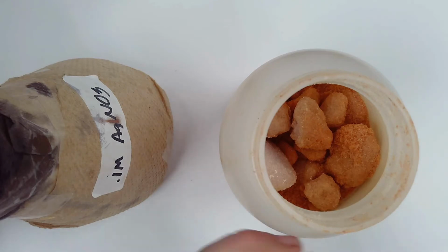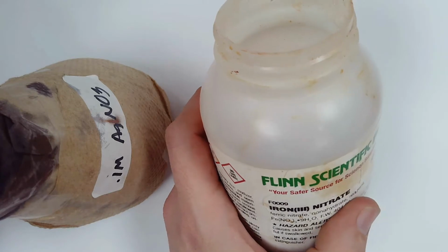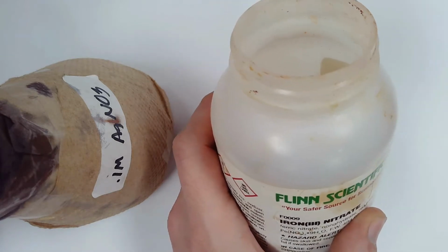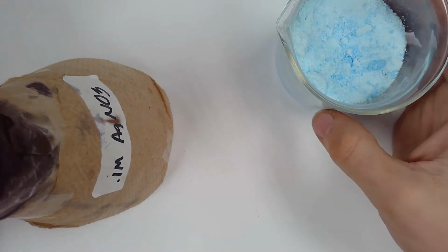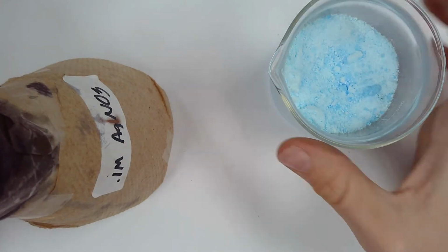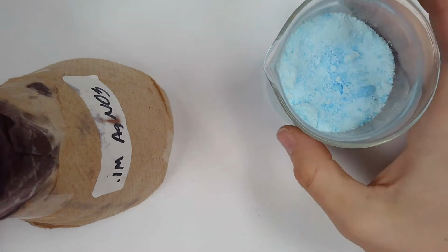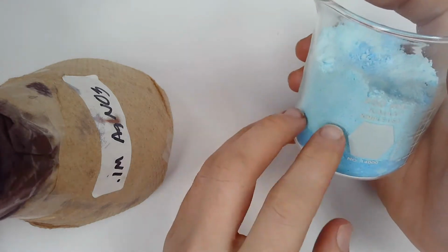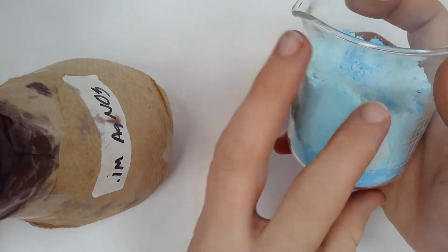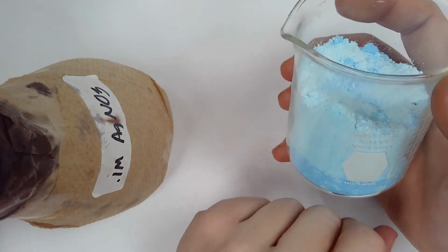So what symbol would tell me that I have a chemical which, put in water, will break apart or dissociate? You know, I was thinking about it. Let's add one more salt to this. Just because all the other ones are white powders, let's have a little color mixed in. So this is copper 2 sulfate, CuSO4. You can see it's got a couple different colors going on here. What's going on with that is this has got water in it, and this is starting to dry out. It's not going to change anything for us, but let's throw some copper in there.